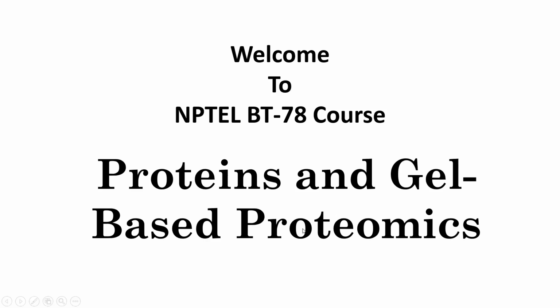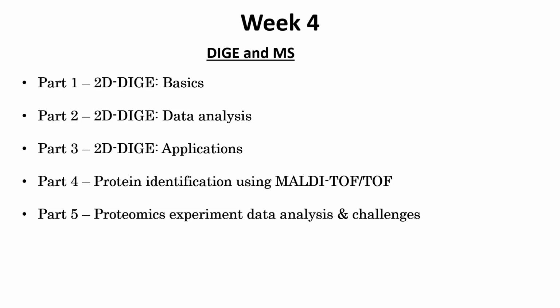So this is the week 4 lecture and this is a 4-week course. This is the last lecture for our NPTEL course, which codes for BT78, which is proteins and gel-based proteomics. If I get a chance of getting one extra lecture, I might take that, or else this will be the last lecture. In week 4, Sir has majorly dealt with two major techniques, that is DIGE and mass spec. DIGE indicates differential gel electrophoresis. In this specific week he took 5 lectures, and I've divided those into 5 parts similarly.